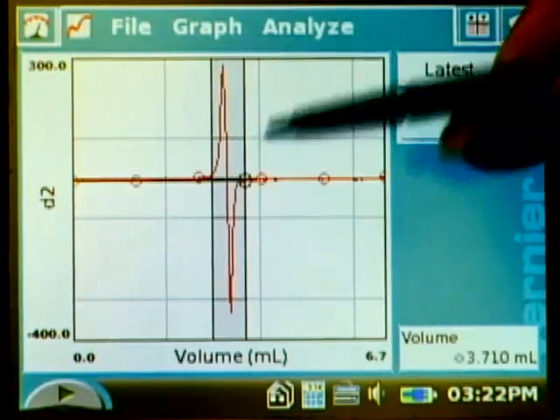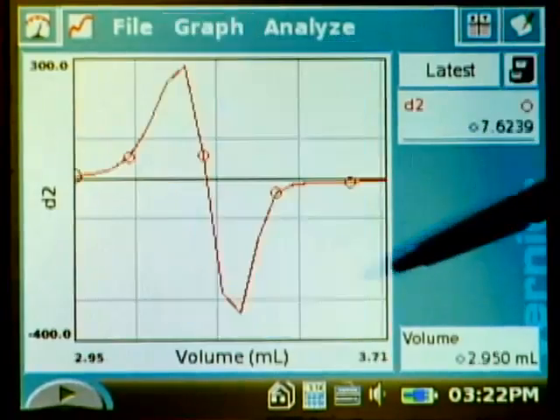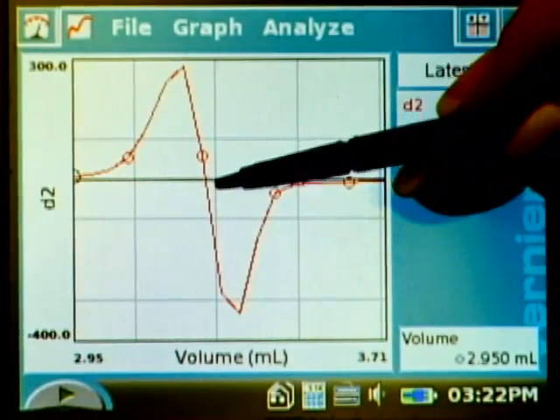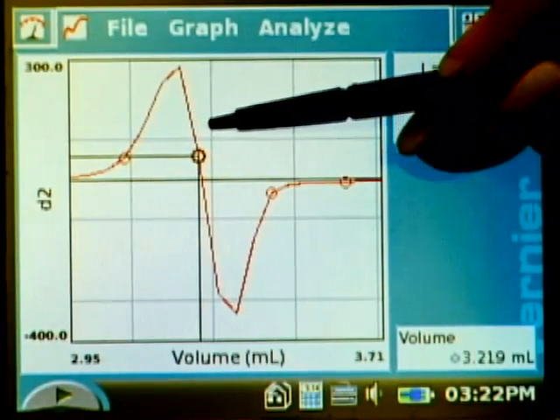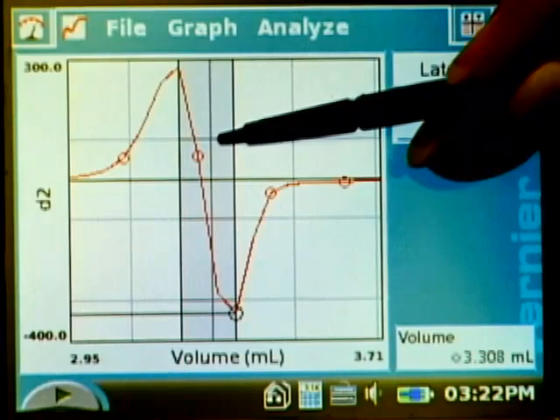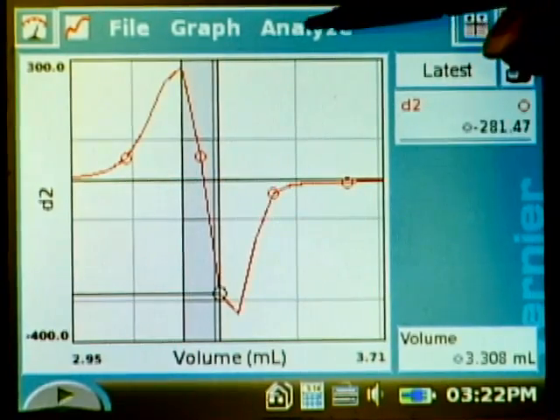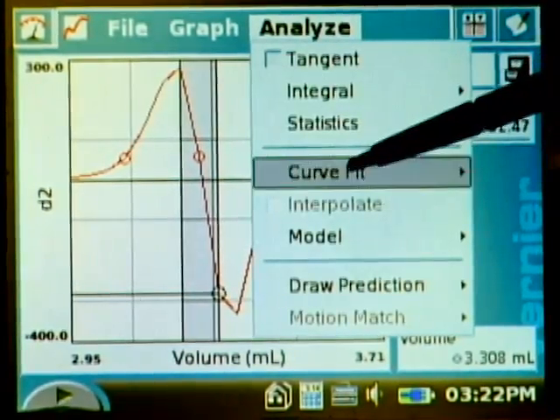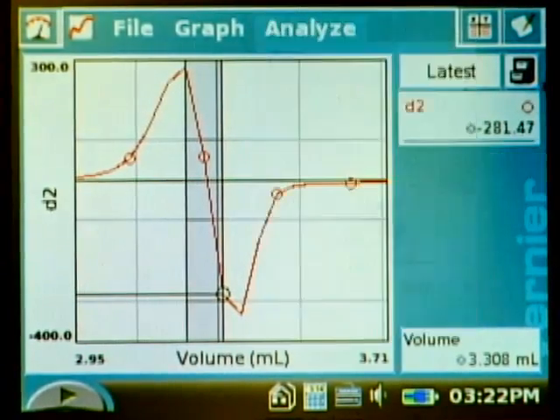right around that point and then do a zoom in. You can see right there where it crosses. I'm going to select a region of this line where we have a linear portion and do a linear curve fit on that section of the second derivative.